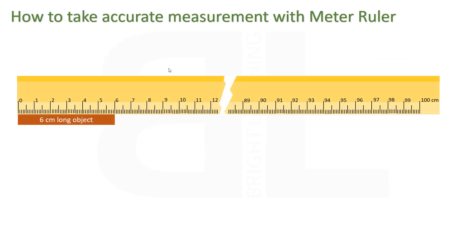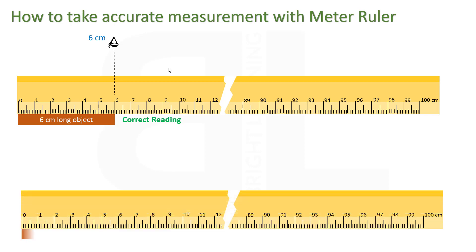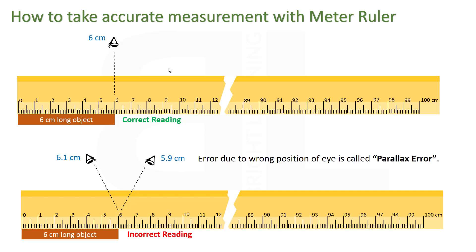How to take accurate measurement with a meter ruler? In order to measure an object using a meter ruler, place the object with the side of the meter ruler and place your eye vertically on the meter ruler. This will give you the correct reading. If you keep the wrong position of the eye, it will give you an incorrect reading. Such an error that occurs due to wrong position of the eye is called parallax error.